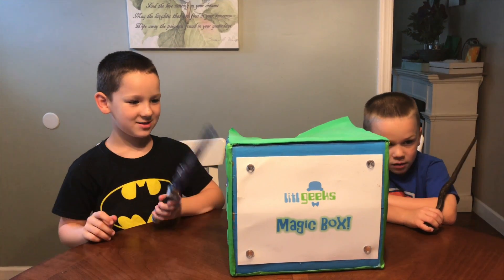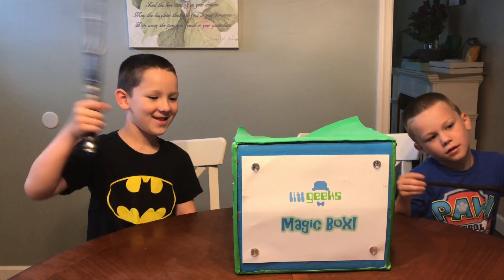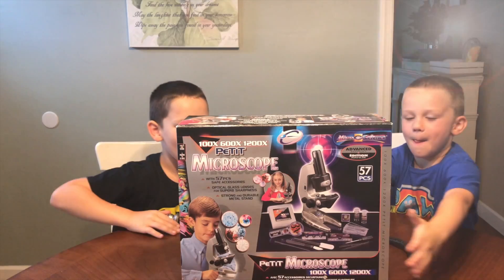Let's see what's in the box. Magic! Well that didn't work. Science! A microscope!